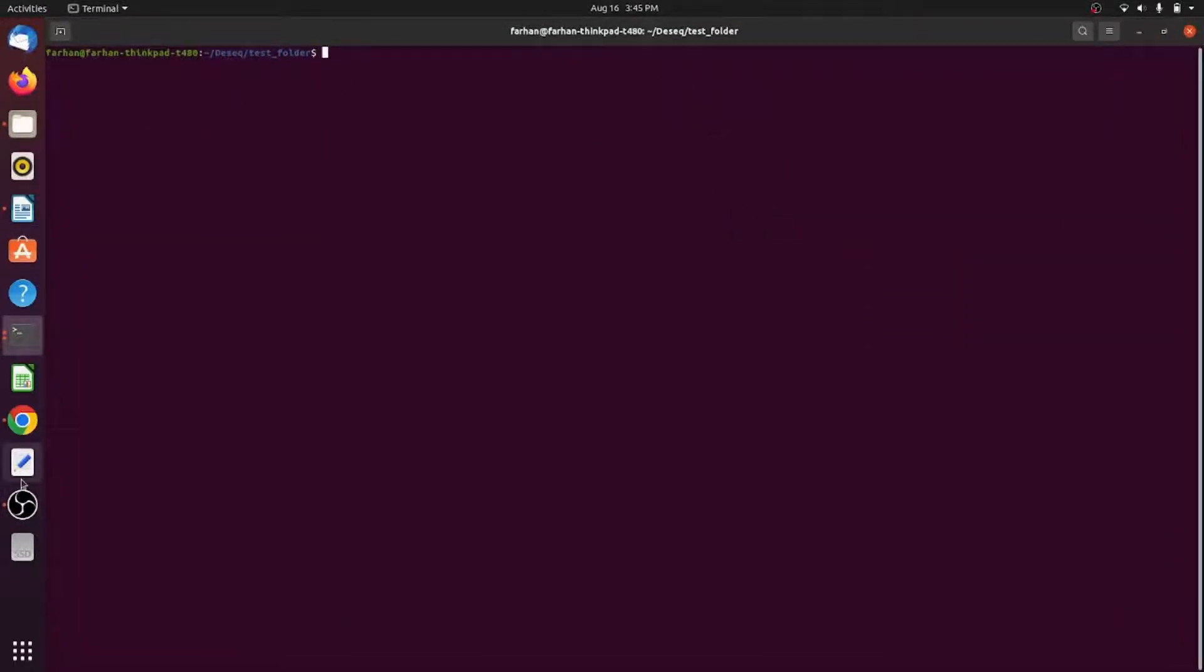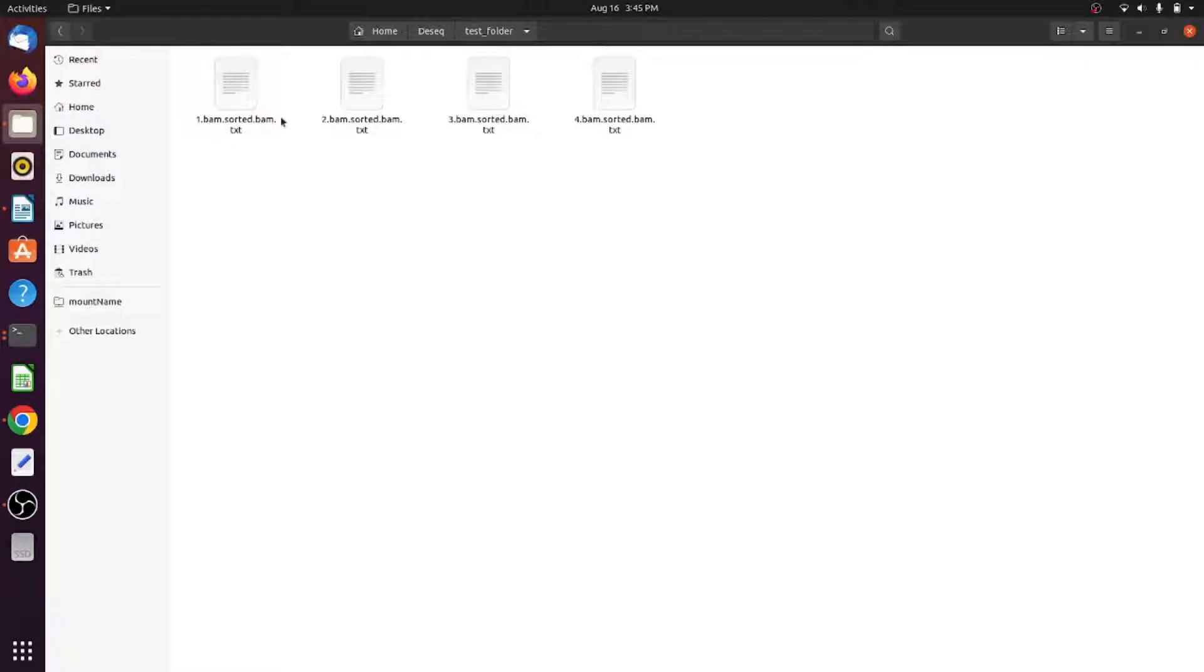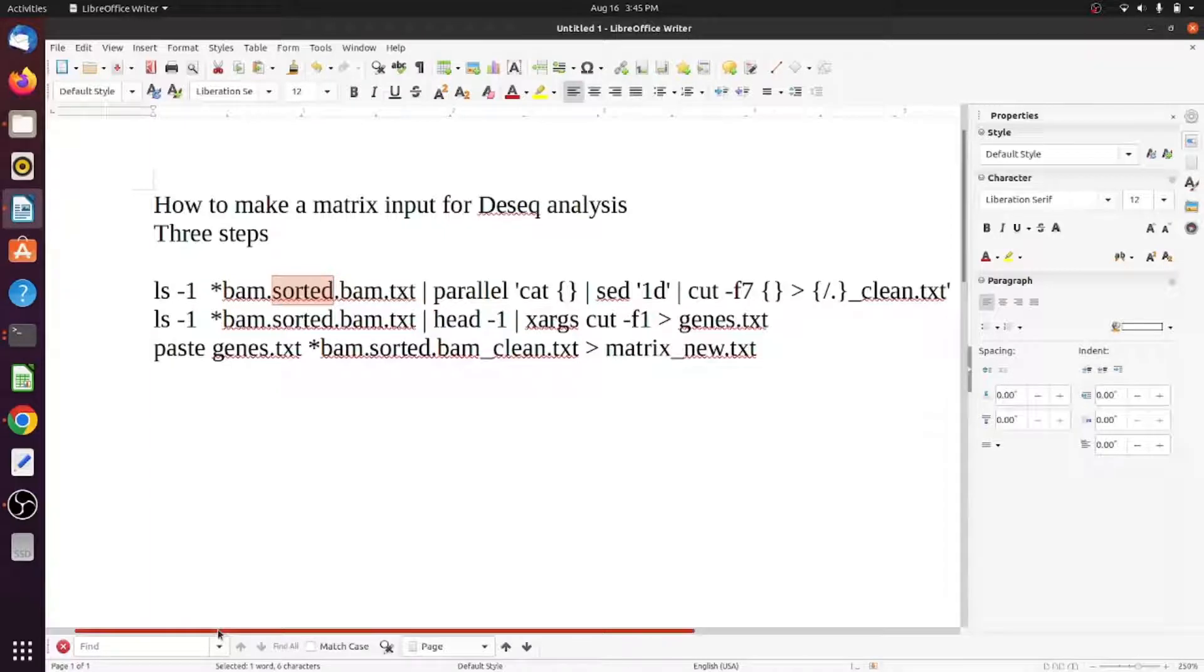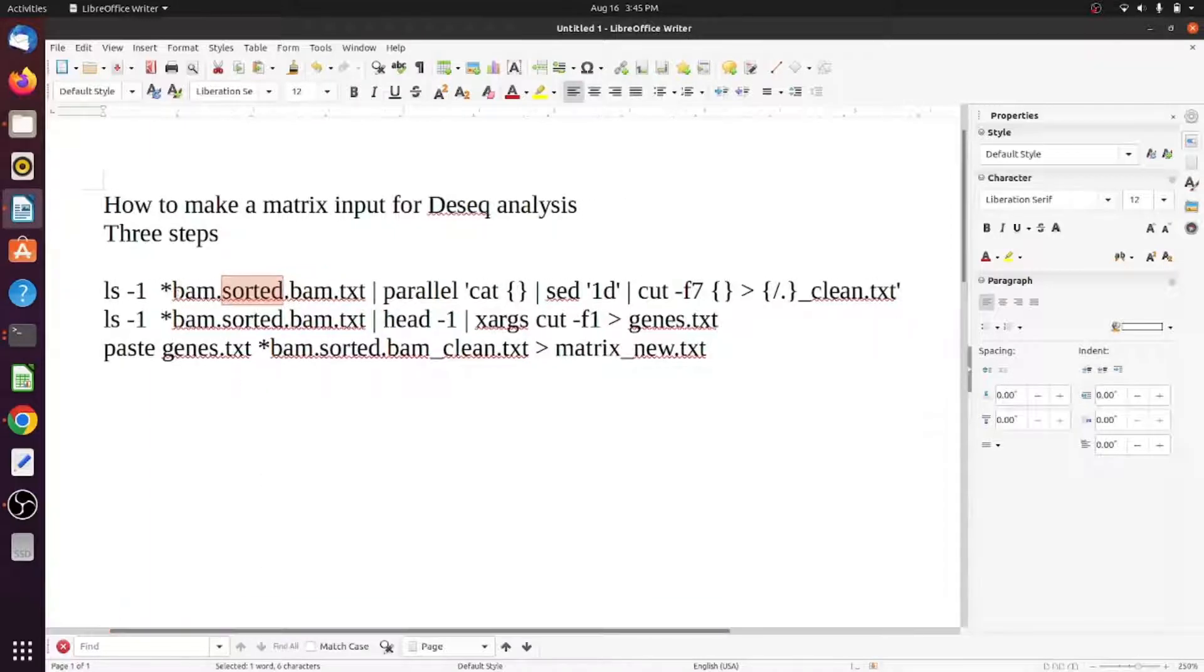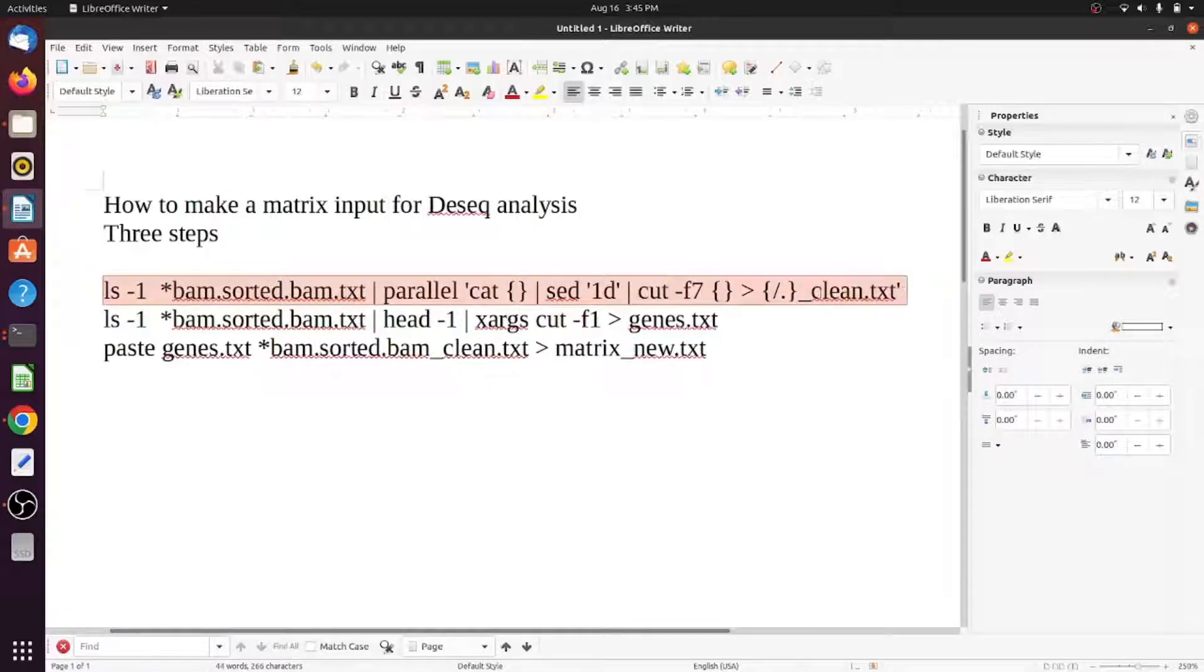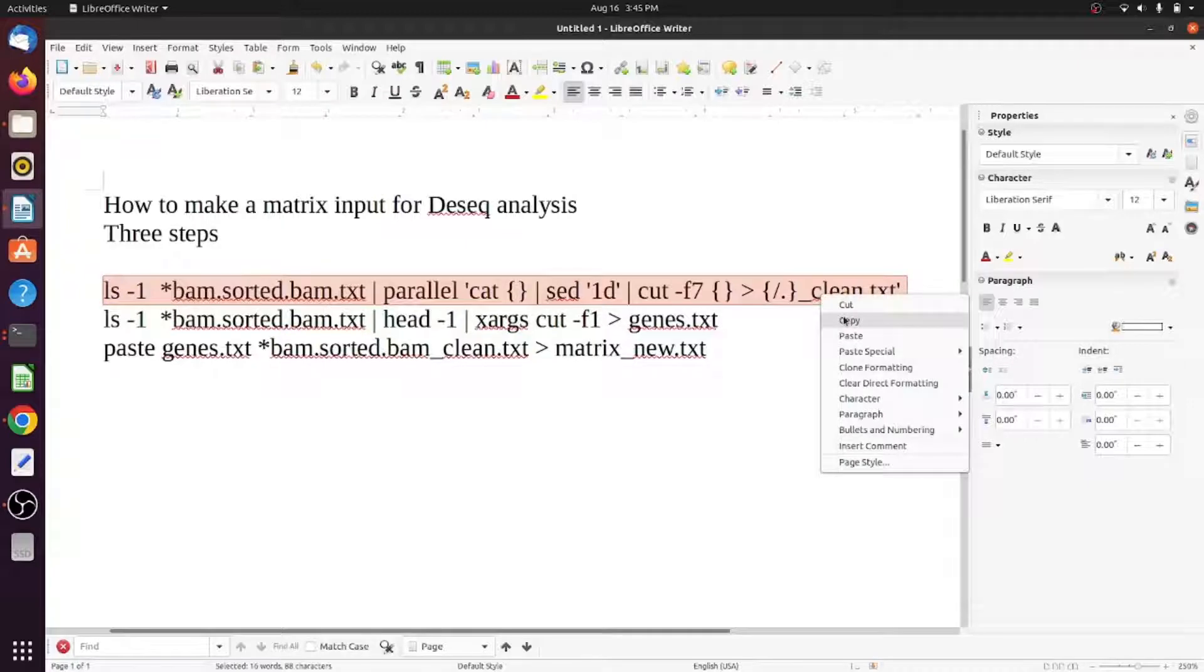Let's go and see how it can be done. This is the folder where I am right now. These are the four files. If I see into the first command, you can see that this file is taking all the BAM outputs and it's making the clean output.